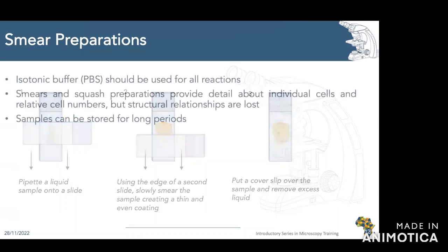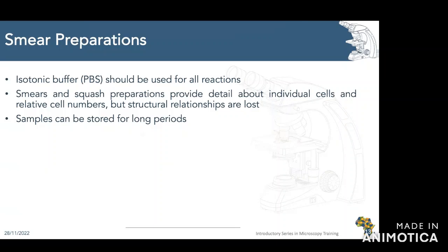So I would say for most of these, you should use an isotonic buffer. PBS works very well. And this is just something to take into account. Obviously, water will pop all your cells.